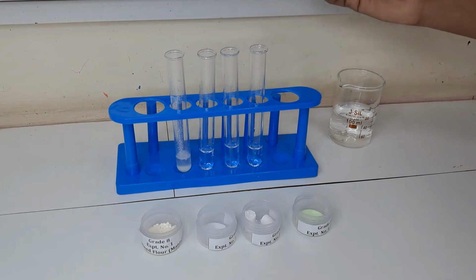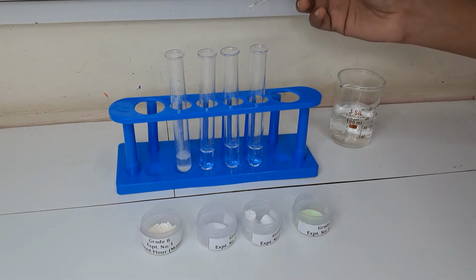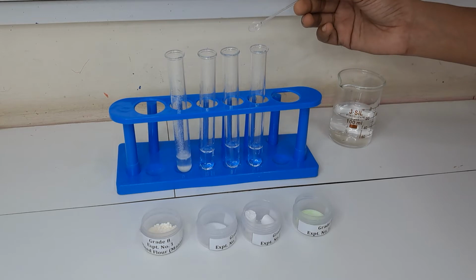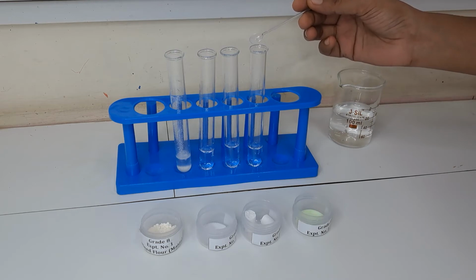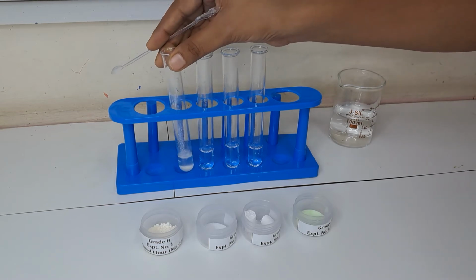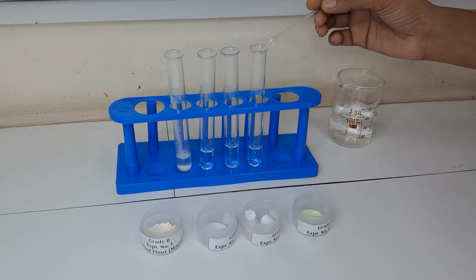By seeing it, you will come to know whether it sinks or floats. You can hear whether any sound appears or not. Or you can touch the bottom of the test tube and check whether the temperature is increased or decreased. You can check the smell also, whether there is any smell or not. So you have to do this first with the refined flour. Observe neatly and write down your observation and conclusion.